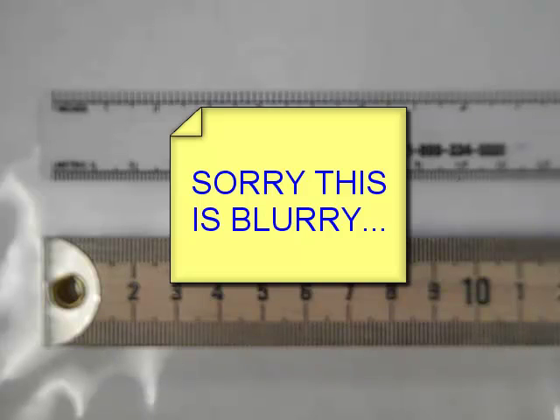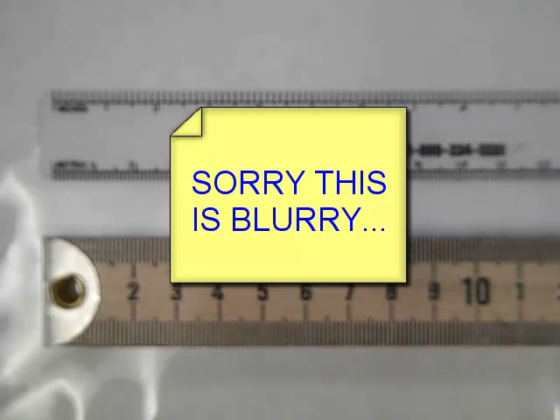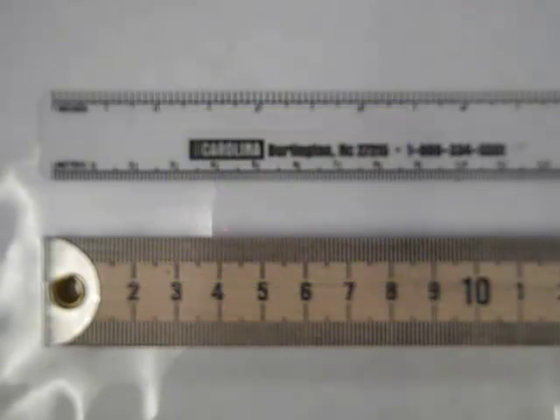All right, welcome to Biology 112. Today we're going to take a look at the metric system, make sure we understand how to use the ruler appropriately.